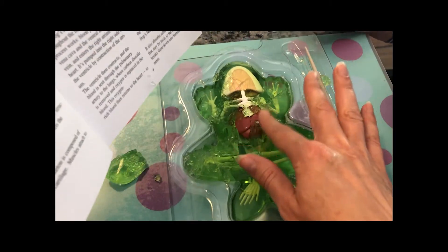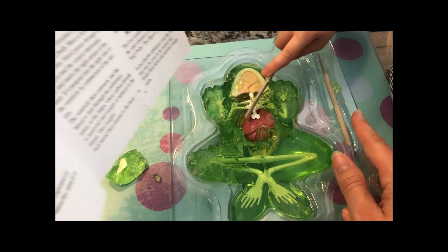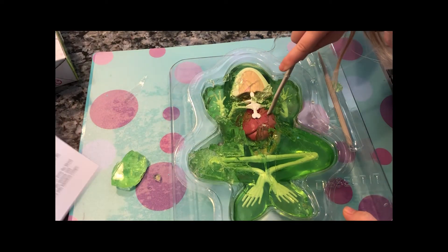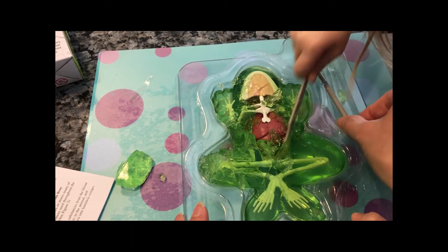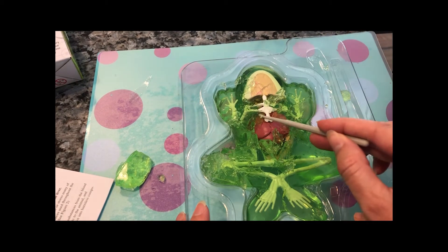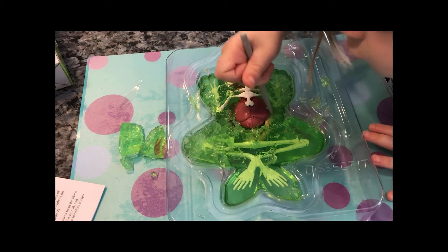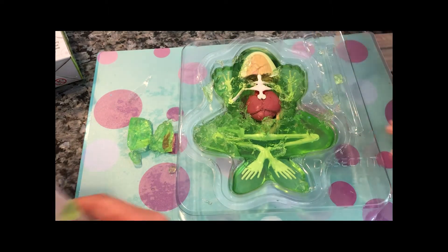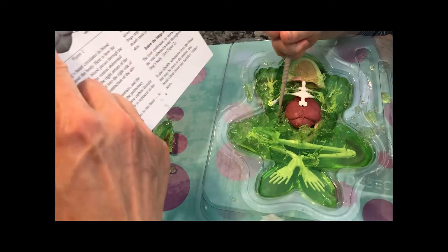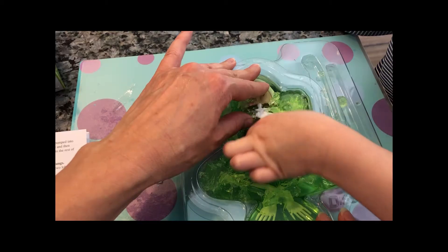First, look for something that looks like this. Do you see something? There. There you go. I think you found the heart. I'm gonna get it. You can always use this too to move things around. I'm pretty sure you just found the heart. Now the heart has a right atrium and a left atrium.